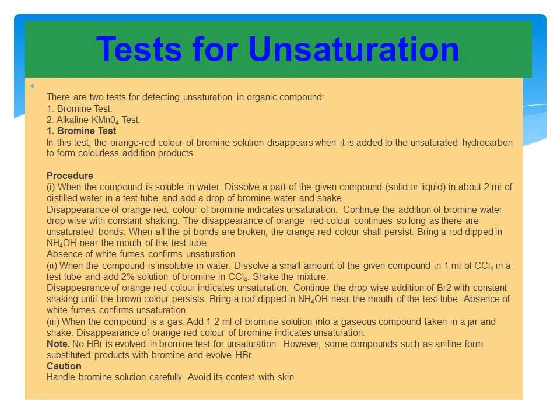So second, when we go through this whole process, the caution is that bromine solution should be handled carefully, because it should not come in contact with the skin, as it is harmful for the skin.